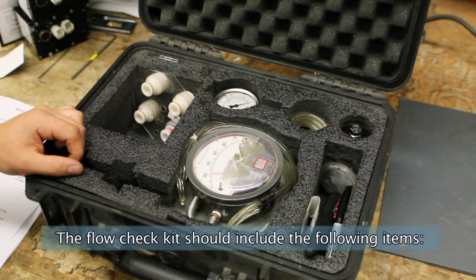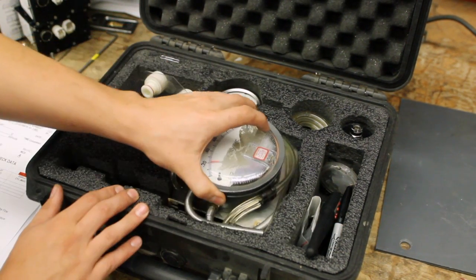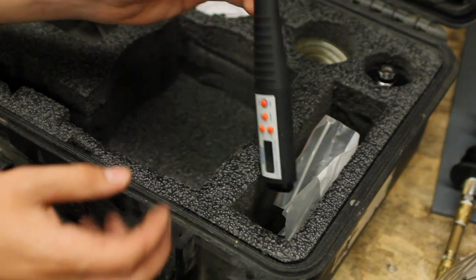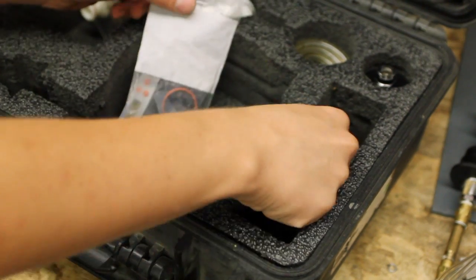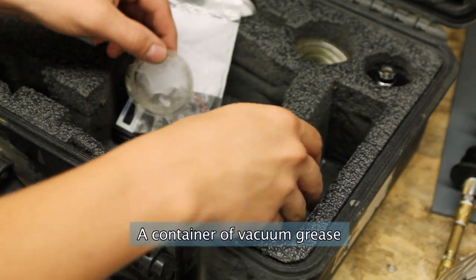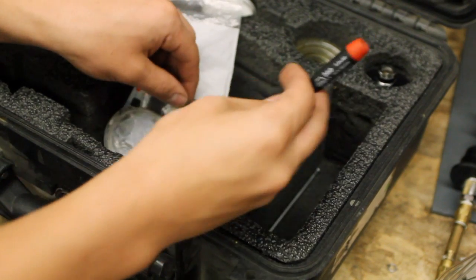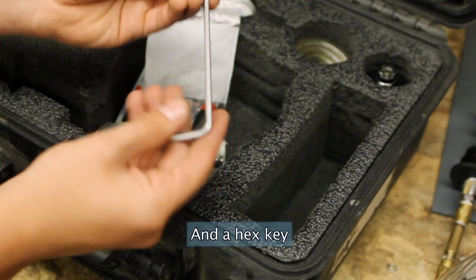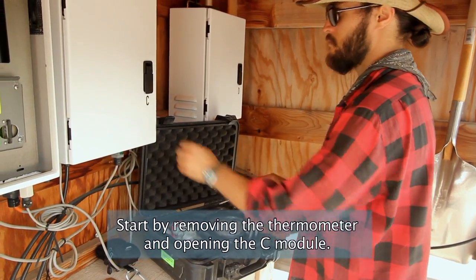The flow check kit should include the following items: the flow check cartridge, the Magnehelic gauge connected with a probe, a digital thermometer, spare O-rings, a black permanent marker, a container of vacuum grease, a hose coupler, a miniature screwdriver, and a hex key. Start by removing the thermometer and opening the C module.